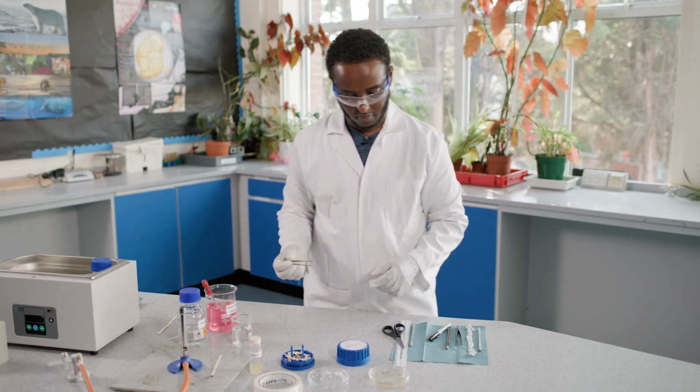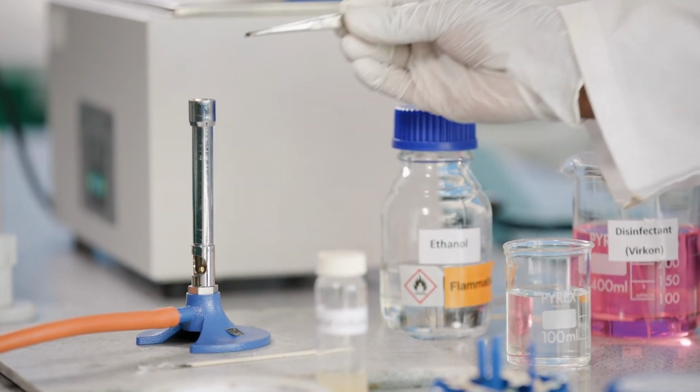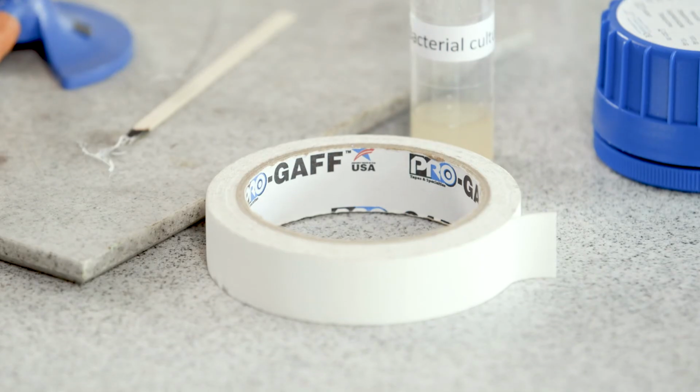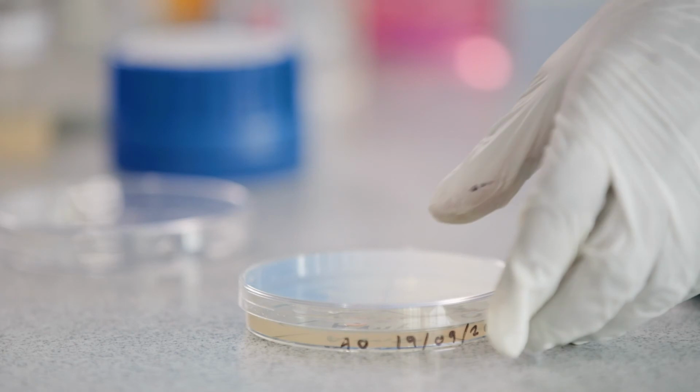Sterilize the forceps by dipping them into ethanol, then passing them through the Bunsen flame to ignite the ethanol. Tape the lid onto your Petri dish with 2 pieces of tape and invert the dish. Leave it at 20 to 25 Celsius for 2 to 3 days.